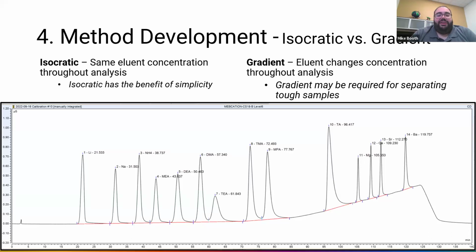And this particular run, again, we paid a pretty big price in terms of time for this. So this is a 140-minute run time. It does what we need it to do, and thankfully we don't have to do this method very often.